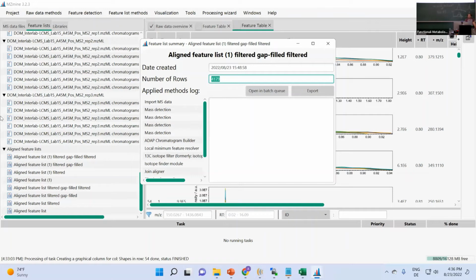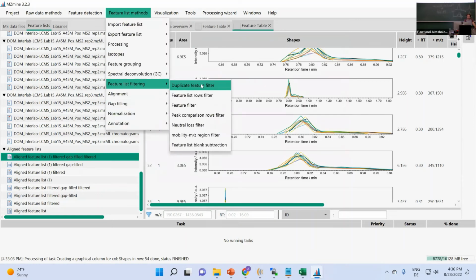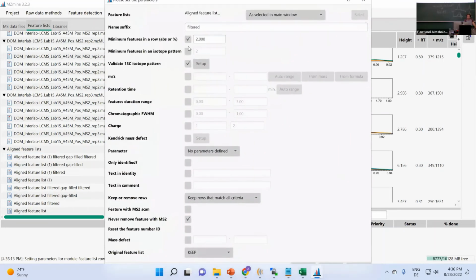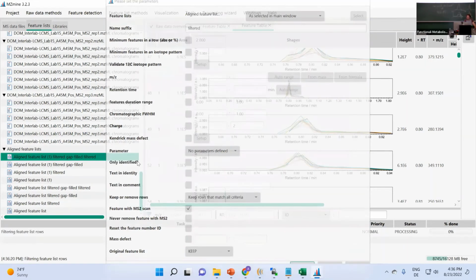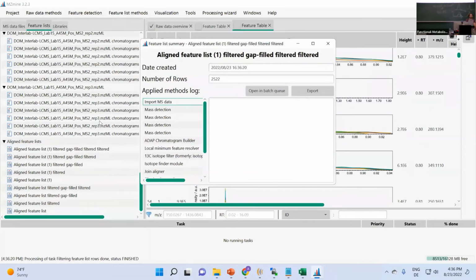So I think that's important to keep in mind, not only now for the project work here, but especially when you go back to work on your own data. So yeah, if you have doubts, again, we're here all week, right? We can chat about the particular jobs you run, or perhaps about your own data.